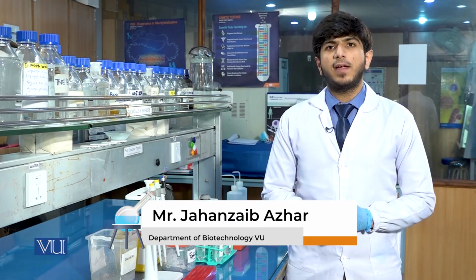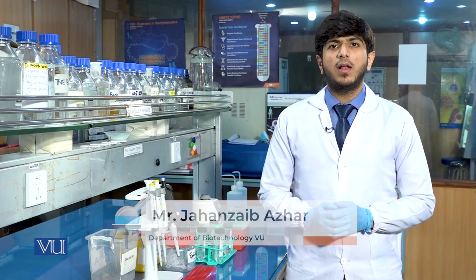In materials and instruments, we need different reagents like lysis buffer, proteinase K enzyme, sodium dodecyl sulfate, ethanol, and isopropanol. In instruments, we need pipettes, pipette tips, vortex, centrifuge machine, and deep freezers to store the DNA.